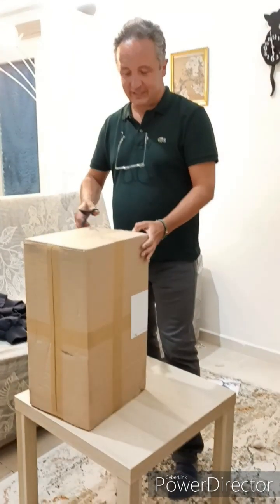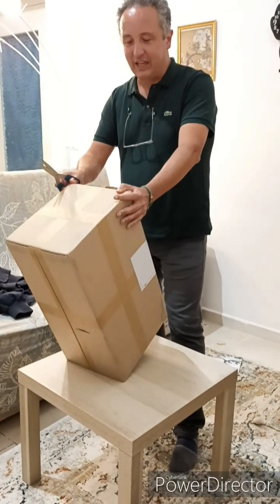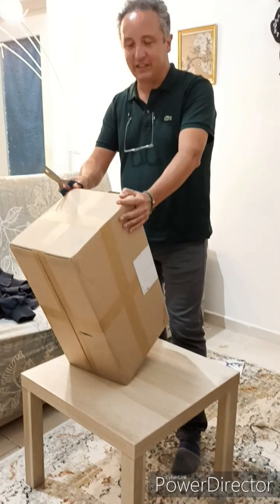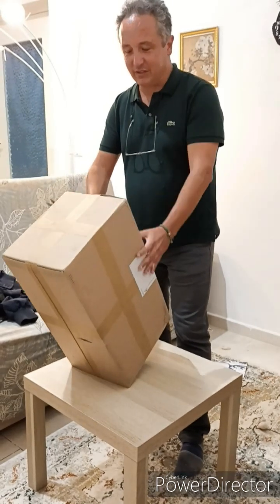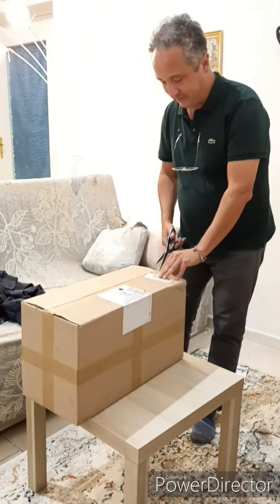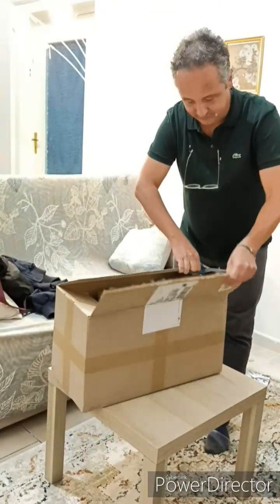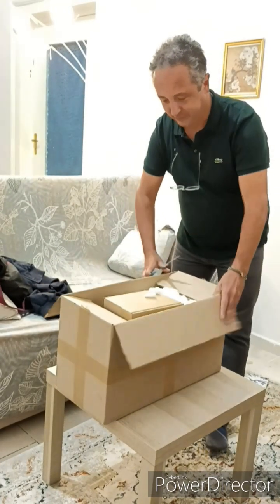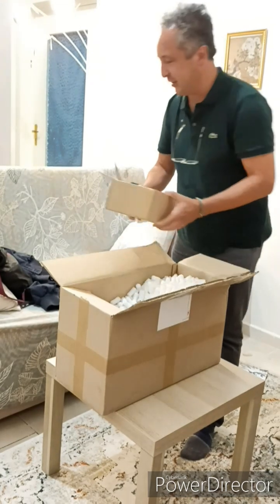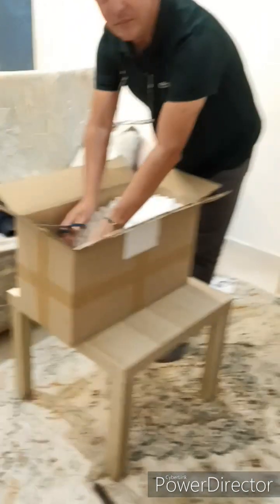The first boxed stand just arrived. We ordered a bioreactor for growing algae, and now let me see what is inside. I will open the box — there is a small box inside; it should be the air pump, and the main bioreactor.